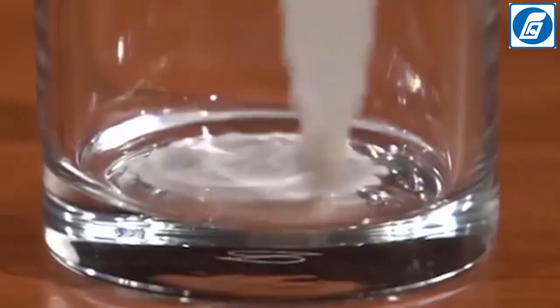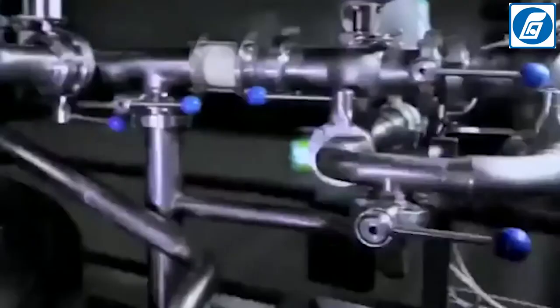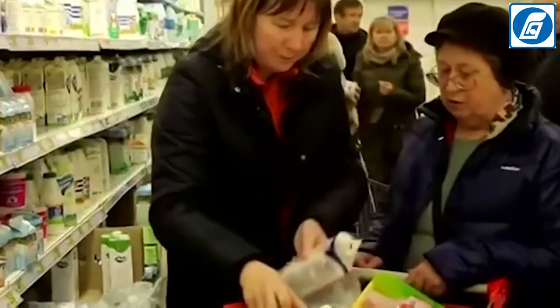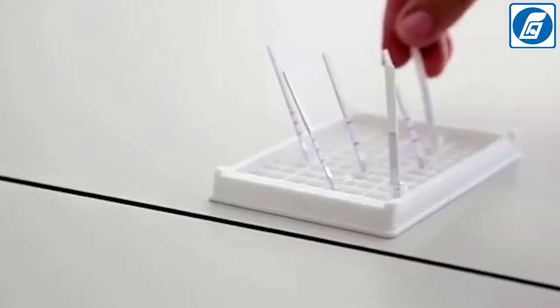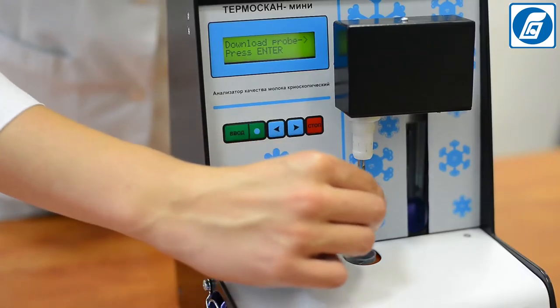Currently, detection of milk adulteration is a very pressing issue, especially for milk processing plants and enterprises. Milk producers resort to various methods of adulteration to hide low quality and retain costs when milk is delivered to processing plants. There are laboratory analysis methods for identification of various types of adulteration; however, these methods require additional expenditures on chemical reagents and time, as well as high qualification of lab personnel. Now we will demonstrate how Temascan Mini is used to detect these adulterations.